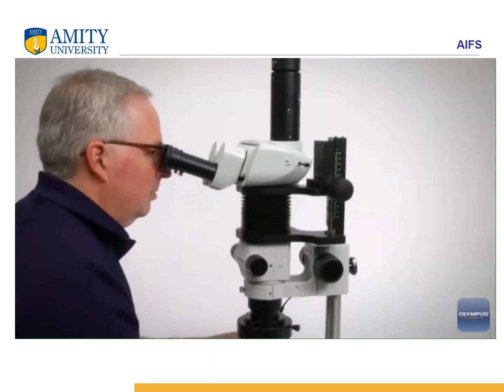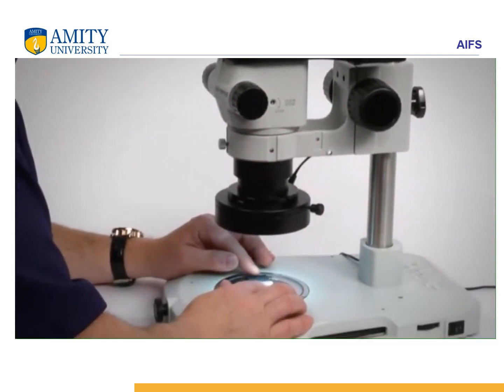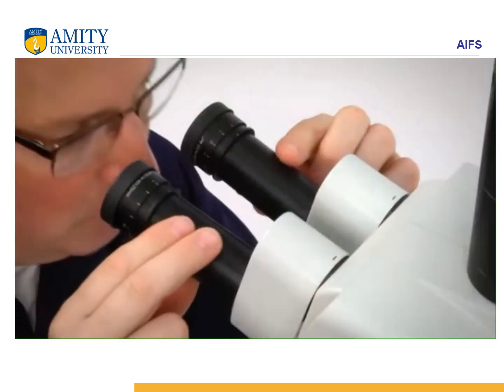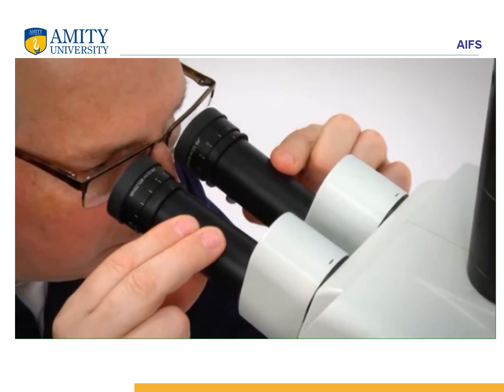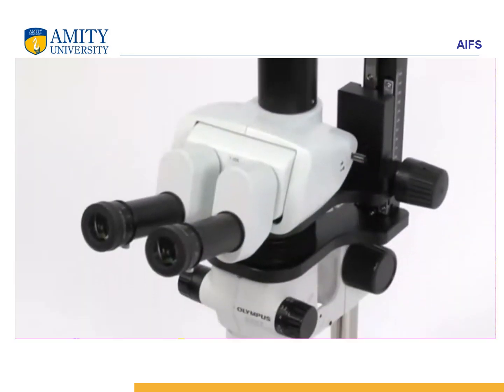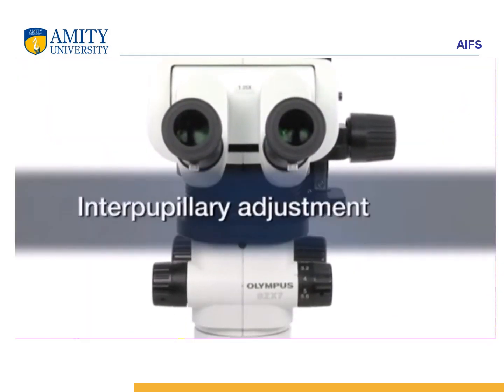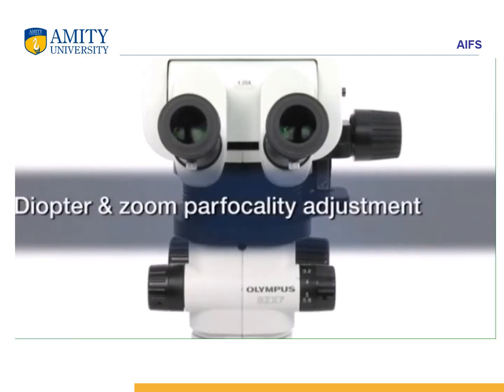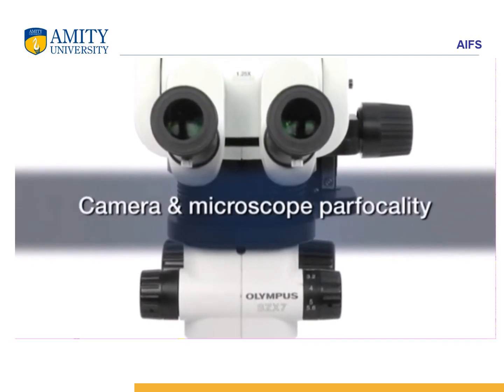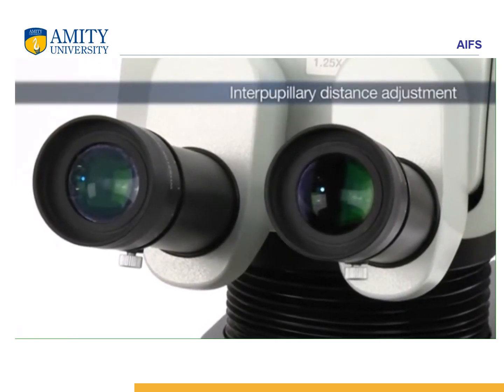So here we are watching a stereo microscope. The observer has placed the sample. This is adjustment of interpupillary distance. The person is now observing a motherboard under the stereo microscope, which is a macro specimen. Now there are diopter and zoom parfocality, camera and microscope parfocality. We will be discussing these things here.